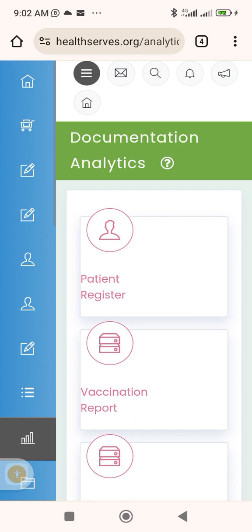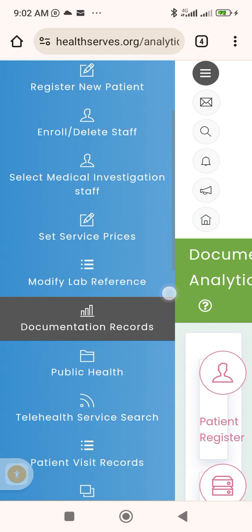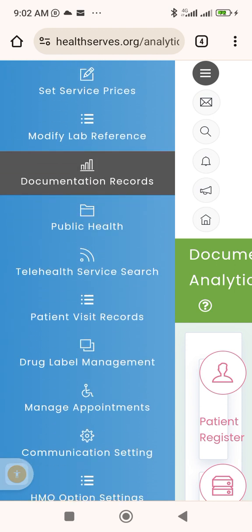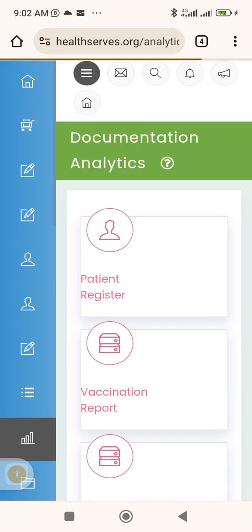It will be added very soon. All right, so at this point, let's now go on and run the test. There are still a lot of things here, but I won't be able to show you everything all at once. Let's now log into a staff interface so that we can run the test proper.